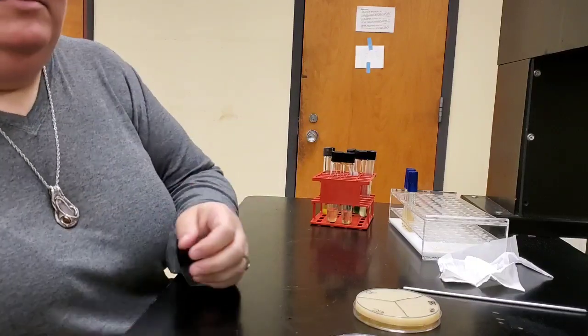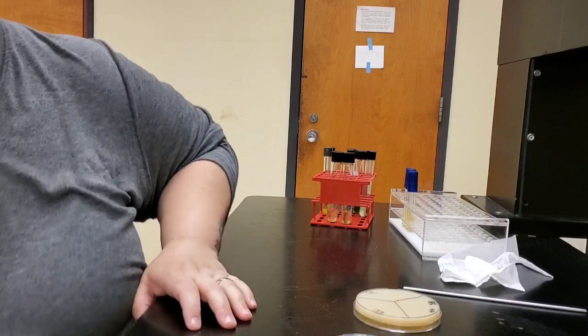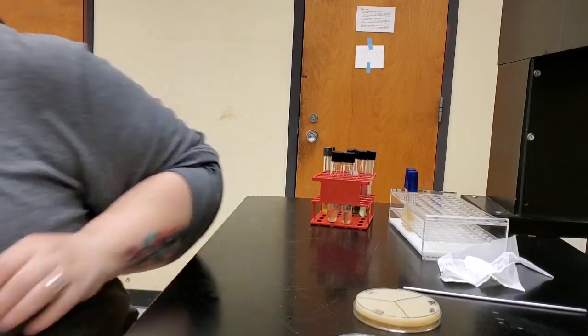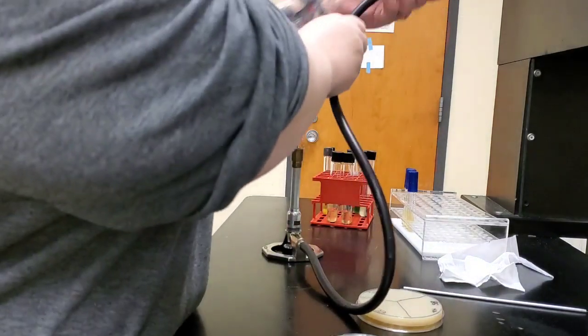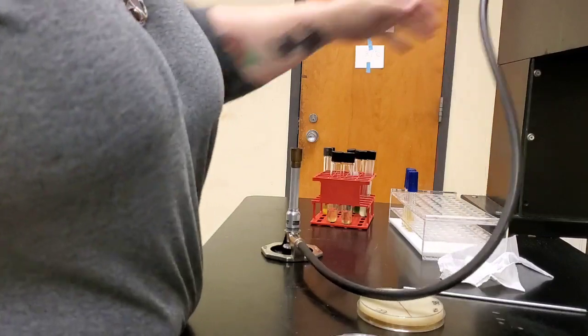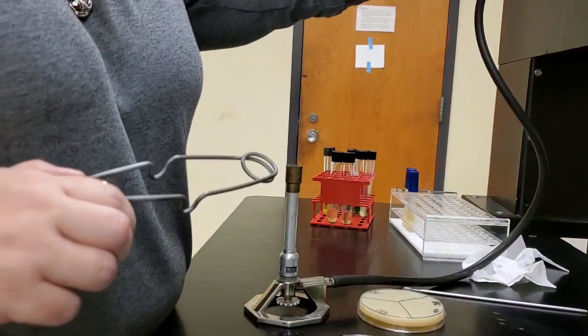So we're going to set up our Bunsen burner and inoculate these plates, and then we will put them in 37 degrees Celsius for incubation for 48 hours.